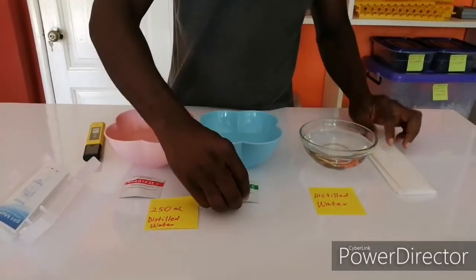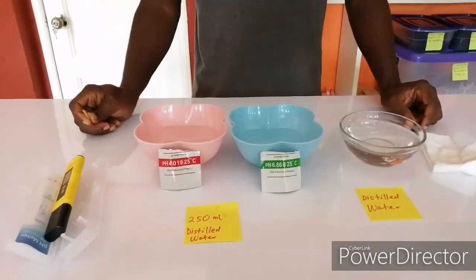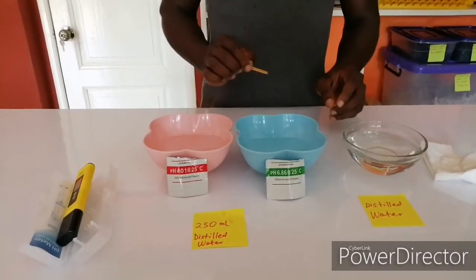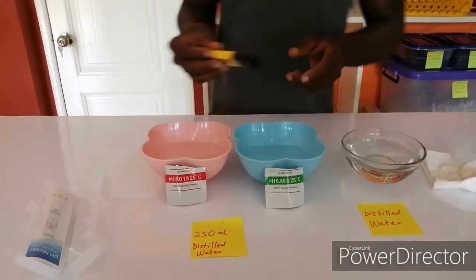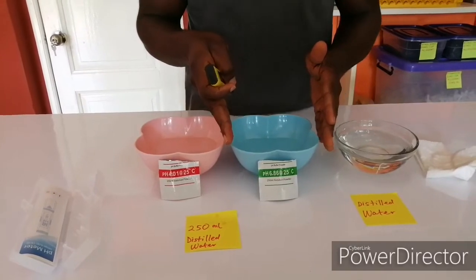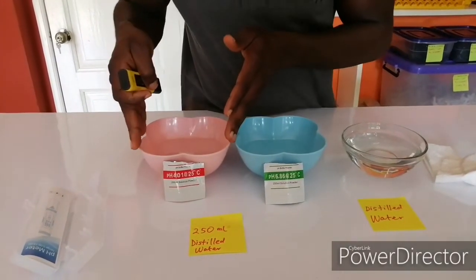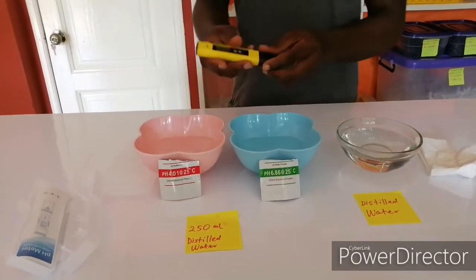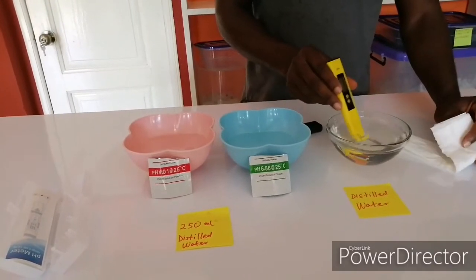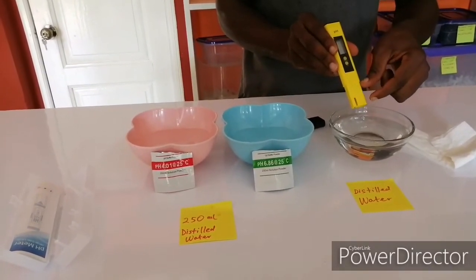My tissue is ready for rinsing. After stirring, we begin the calibration. We calibrate with the 6.86 buffer first, before we calibrate with the 4.01 buffer. I'm going to take the cover off and rinse it. When you dip it, don't dip it over this line — just keep it below this line.